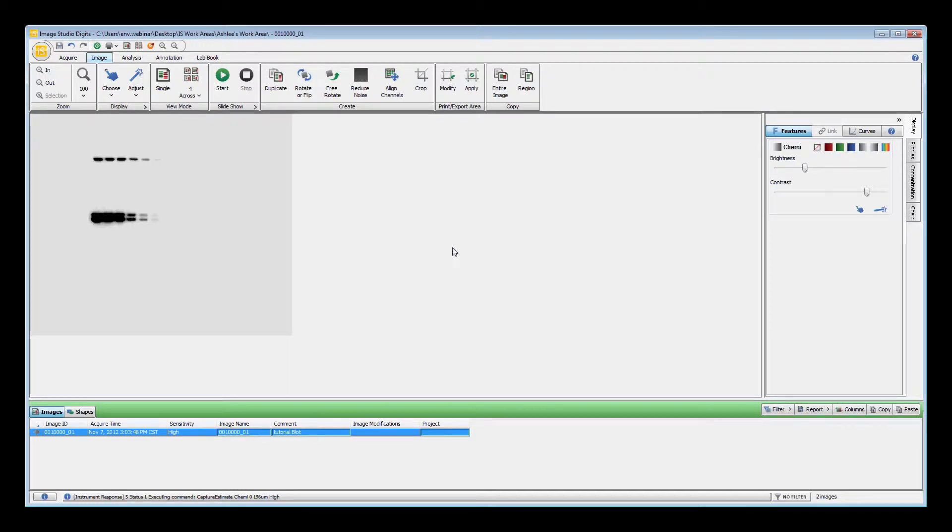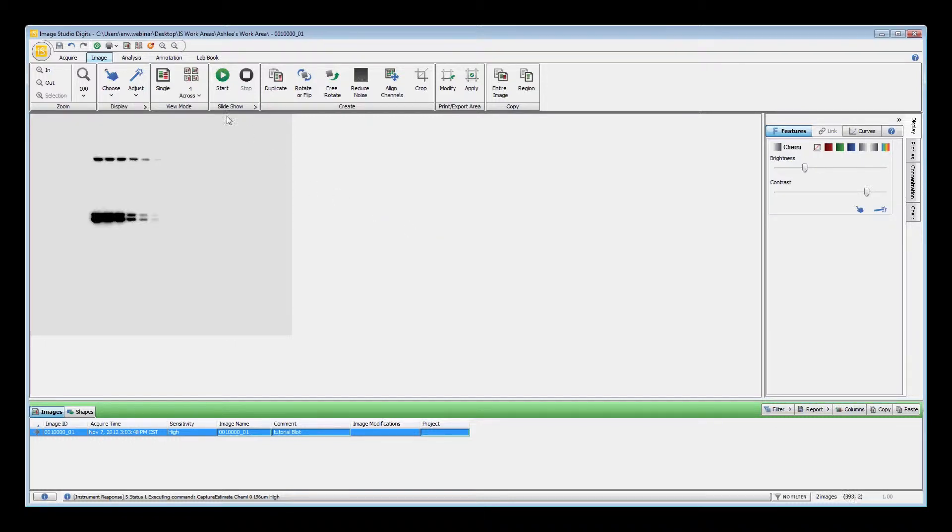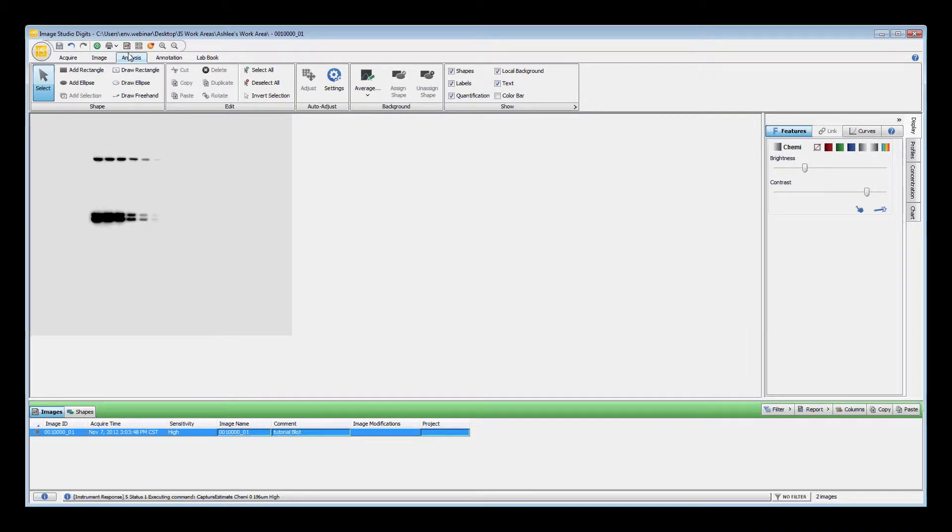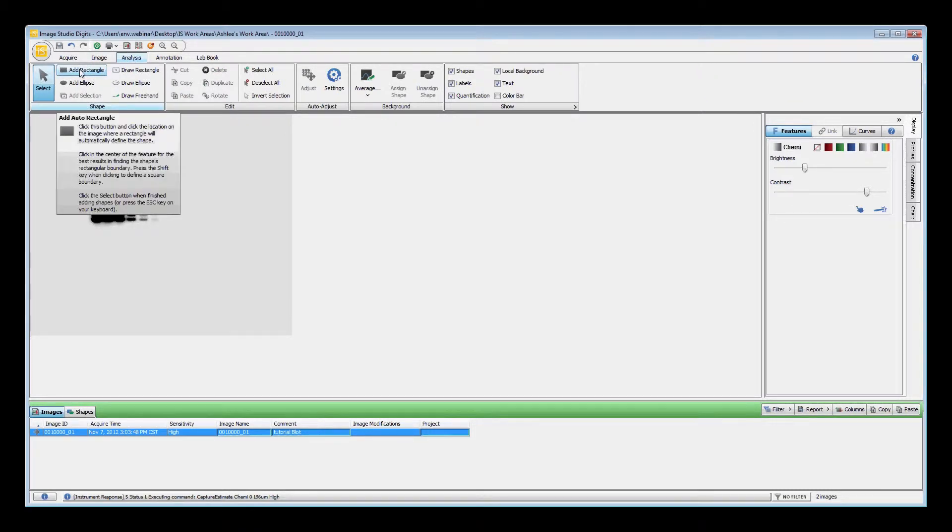The first step of image analysis is to identify the bands in your image by adding shapes either manually or automatically. To add shapes around the bands in your image, click the Analysis tab. We are going to automatically add rectangles around the bands, so we will use the Add Rectangle button.